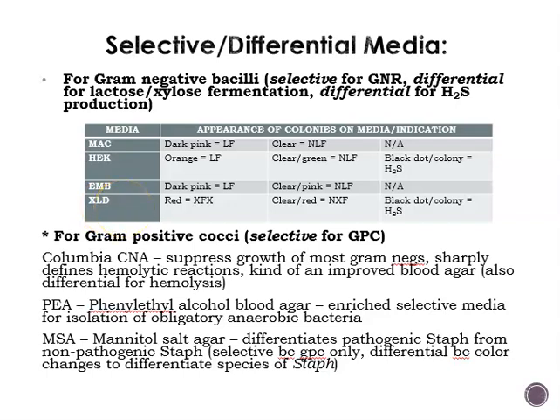XLD is just a little bit different. It's the same function as the Hektoen, but the sugar in the media is xylose instead of lactose. So again, same concept. We're still trying to recover Salmonella or Shigella, both of which are non-sugar utilizers, so they're considered non-xylose fermenters.